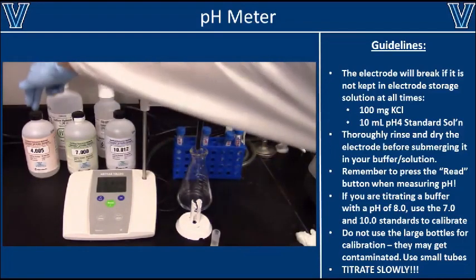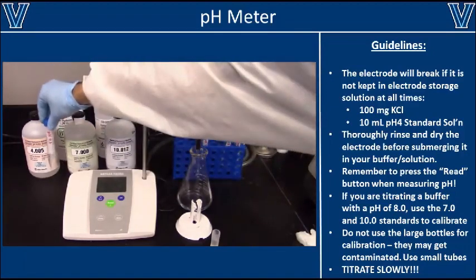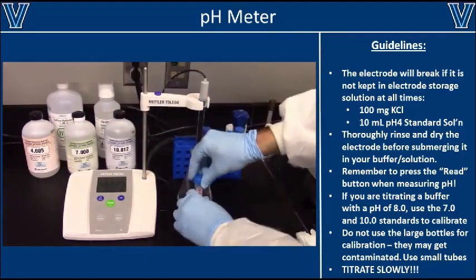To calibrate the meter, pour a little bit of the standard solution into a 15 ml tube. This prevents the main standard solution from becoming contaminated.